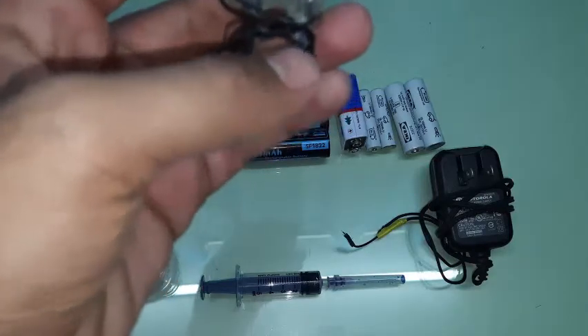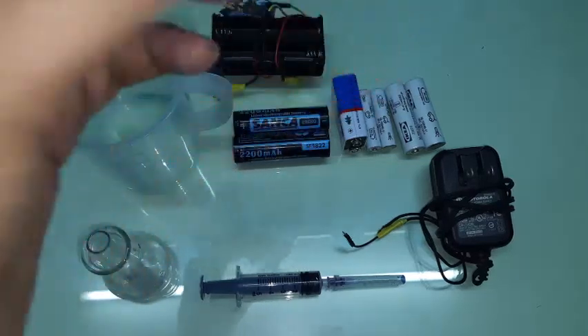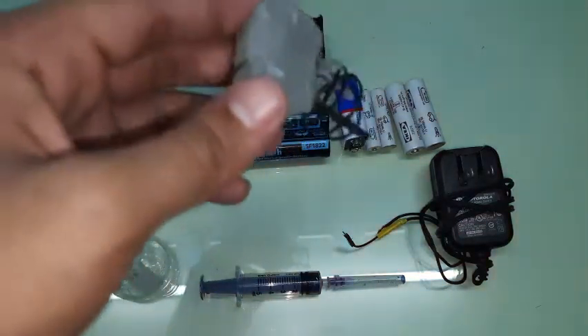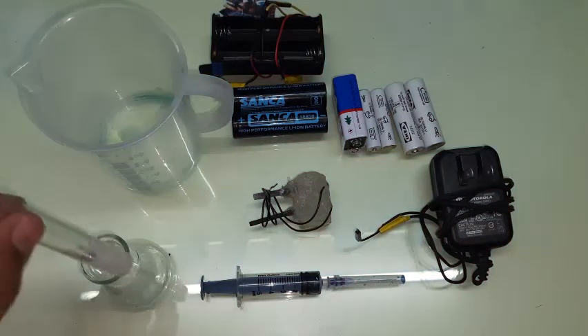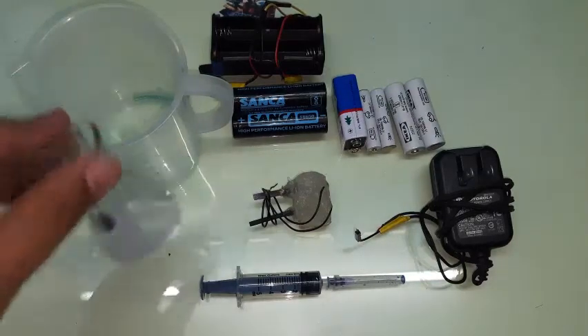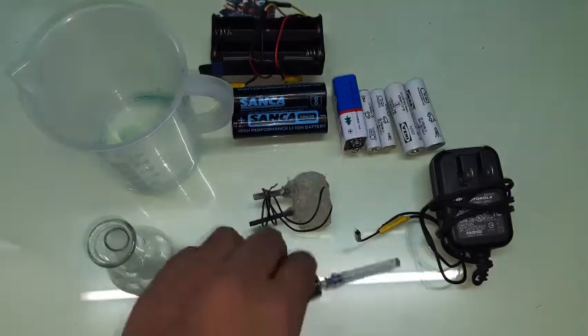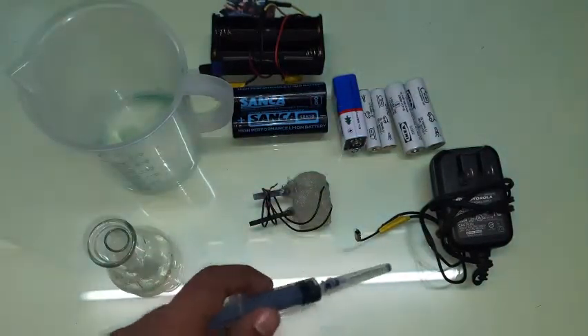Next, you'll need a so-called electrode assembly. I made this myself using two carbon electrodes from old alkaline cells. You should only use carbon as the electrode, because if you use other metals they could undergo intermediary reactions and make your sodium hypochlorite impure.